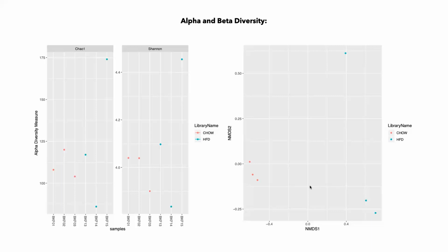In one, you have just blue and red. In another one, you have blue, red, and green. In another one, you have blue, red, and white. And so forth, right? You can either look at each one of those measurements, or you can say overall, okay, these are all the colors that I have. How do these colors represent the diversity between all of my samples? So either you look within each sample that you took, or between all samples.